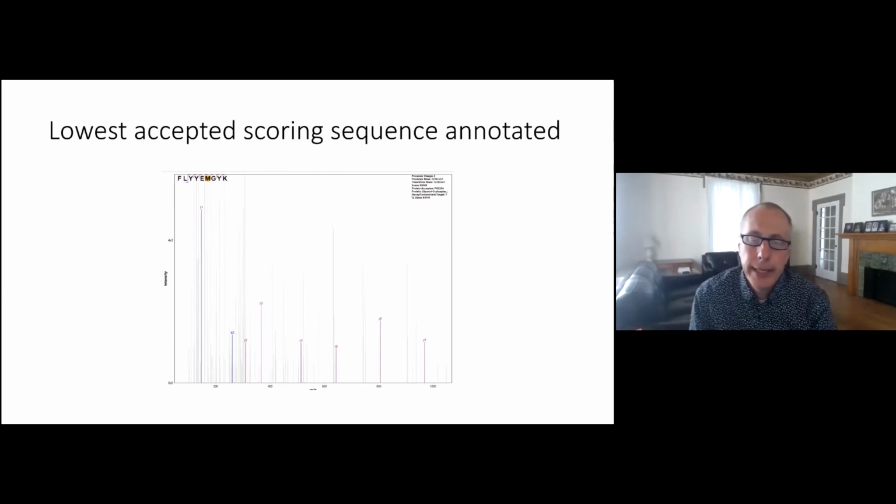Right. So one thing that I didn't get into so far, an obvious thing that happens all the time, is that, as I mentioned, multiple peptides are always coming out of the column. Then we have that MS1 spectrum, and the mass spectrometer selects peaks for isolation. The isolation window, like in bottom up, might be 2 or 4 mass units. Within that, basically any peptide coming out with charge 1 within 2 Daltons will be co-isolated.